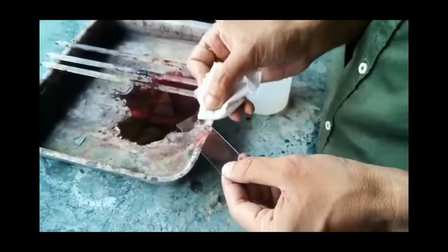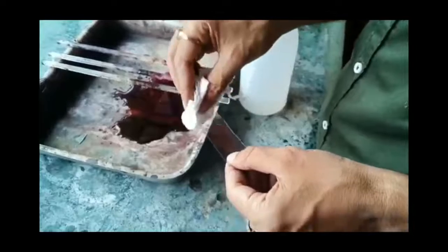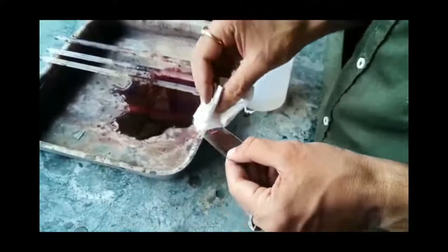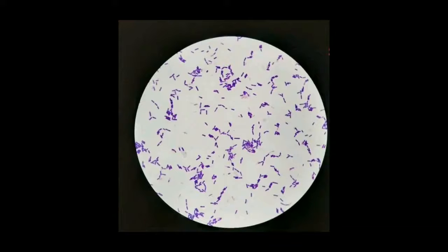The water is completely blotted off. And then we let it stay for some time, allowing it to air dry.